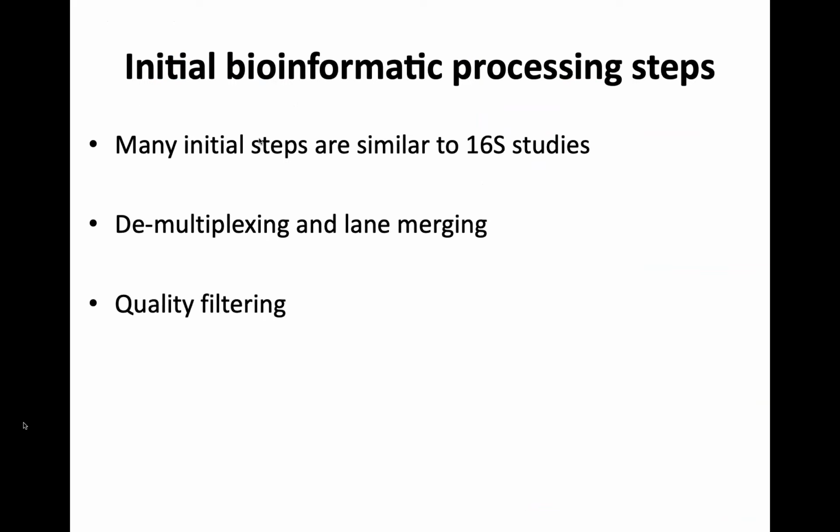Quality filtering is obviously a huge one here. And so me just putting quality filtering is a bit of a thing that I don't have to dive into. It was covered nicely, but things obviously like trimming reads, discarding reads, that really comes into play with metagenomic data, because you don't want to feed low quality, problematic reads into some sort of a taxonomic assignment tool. And that tool, it's hard to say, it's garbage in, garbage out, it won't help it.